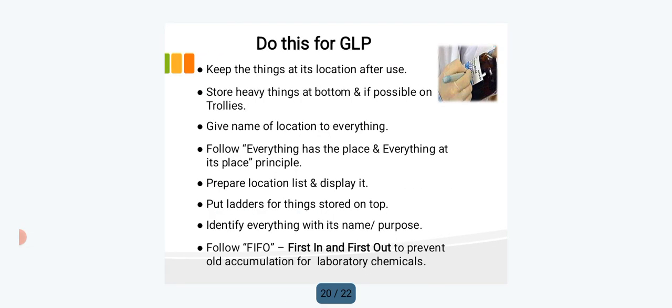Finally, to practice GLP, keep things at their locations after use. Store heavy things at the bottom if possible, and give a name of location to everything.